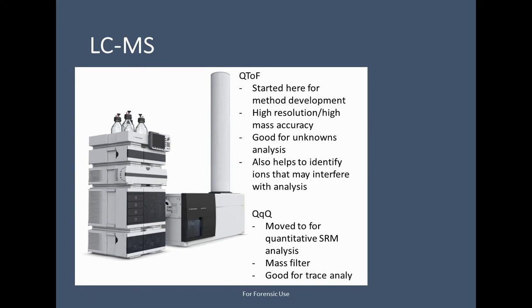And you might not get that if you go directly to a triple quad, because a triple quad will only let you look at what you're looking at, which is one of the reasons why it's an amazing instrument. But in this case, starting from an unusual matrix that not many individuals have tested before, using an instrument that's capable of measuring more ions at the same time, I think is highly valuable. And so this is where we started. And after we developed the method in a QToF, we moved it to a triple quad and made a traditional selected reaction monitoring method for the quantitative performance of this assay. So it's sort of a two-phase approach: method development and optimization, then targeted quantitation, without having to do all that on one instrument.